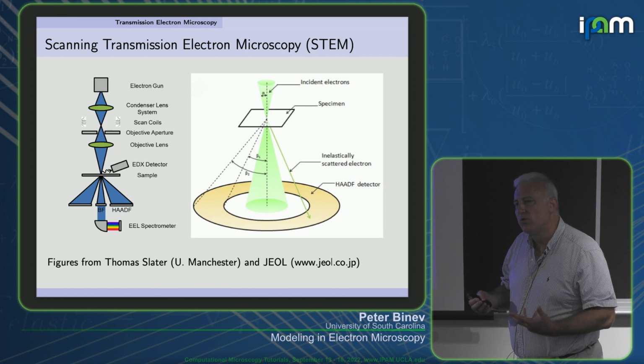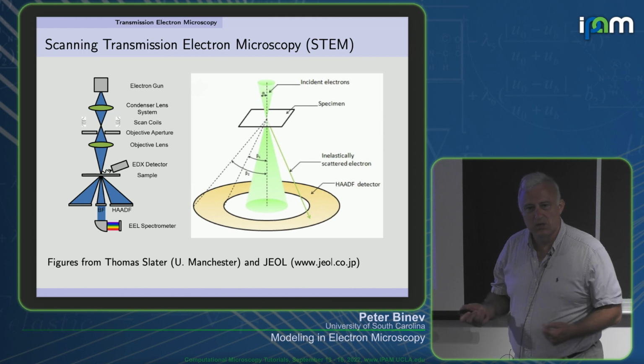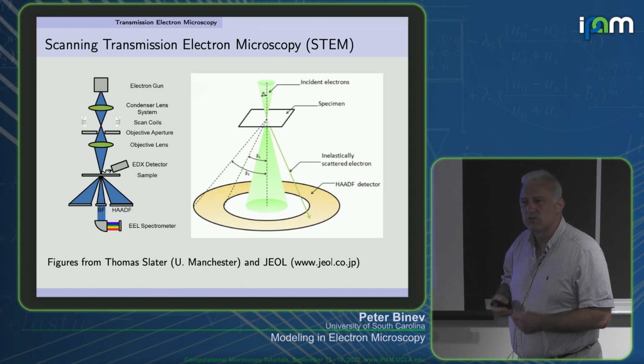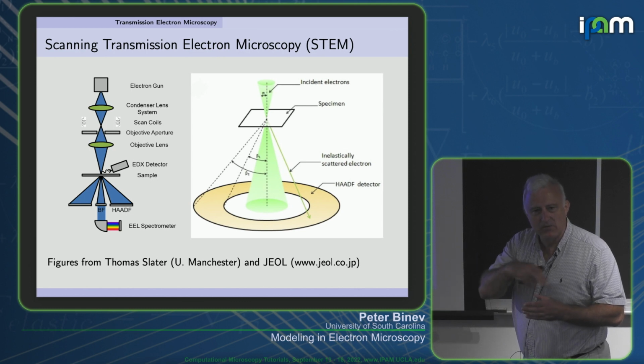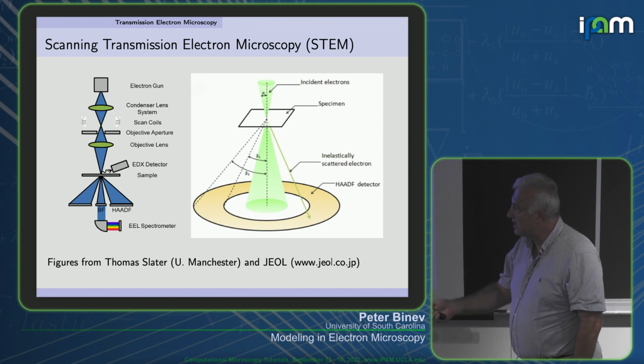I will not be talking about the modeling of how the EDX detection happens, because it is based on the fact that when the electron beam hits the atoms, eventually it takes away some of the electrons in the shell, and because there cannot be an empty lower orbital, the higher orbital electron goes down and fills it, and then emits an X-ray, which is what is measured.